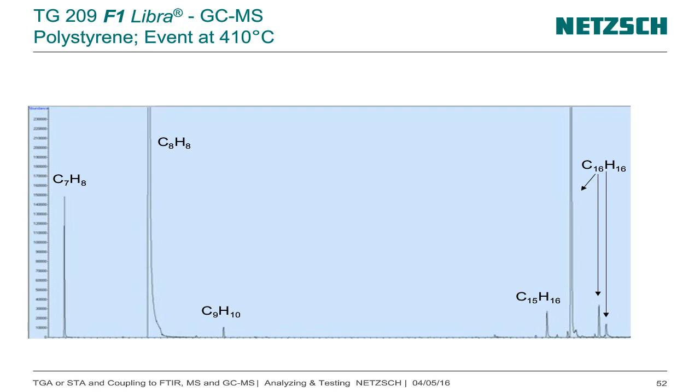And you can also find some other substance if you have a higher concentration. And you see that I have some small peaks where I did not put what it is, because I do not want to overload the slide. So this is possible with the event control.